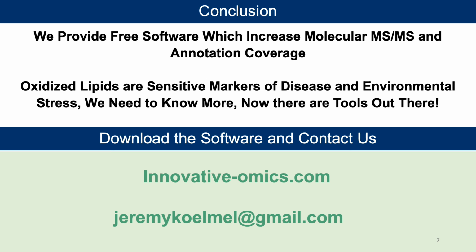And oxidized lipids are sensitive markers of disease and environmental stress we've shown in many applications, and we need to know more. Now there are tools out there, including LipidMatch, and we need more researchers to start to apply them to their applications. Thank you.